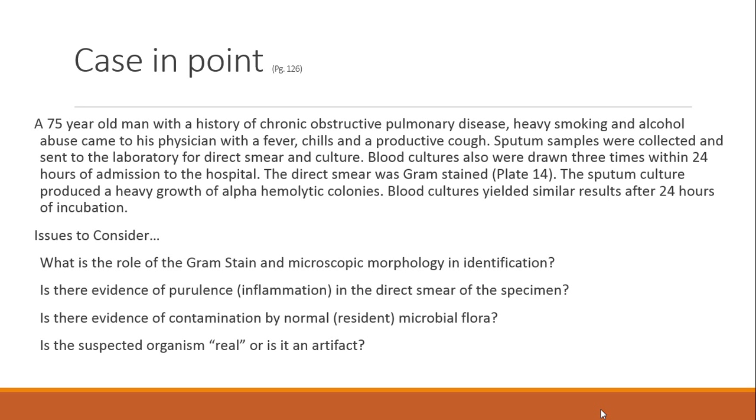So the direct gram stain, direct smear, is on plate 14. So let's find that in our book. It should be near the end of the chapter. There's some images. Page 143, plate 14.